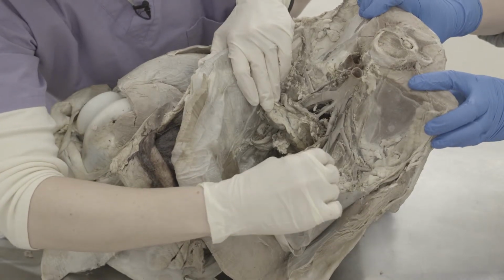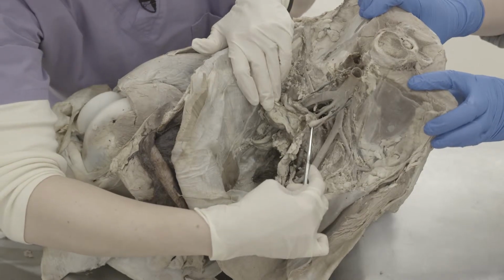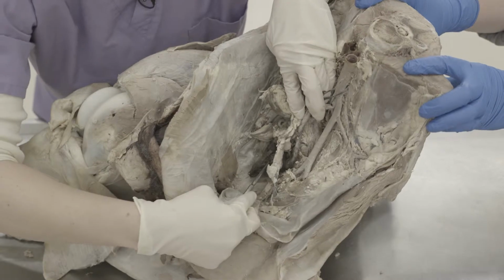So on the internal iliac, you're going to dissect that inside the pelvis, and you're going to find the umbilical artery first. And usually it's very large, and it's going toward the bladder. So this would be the umbilical artery, and you can trace it down to the bladder, which you can see right here.